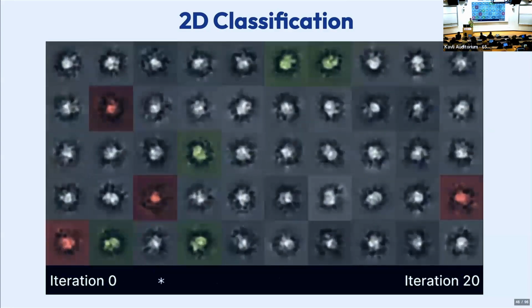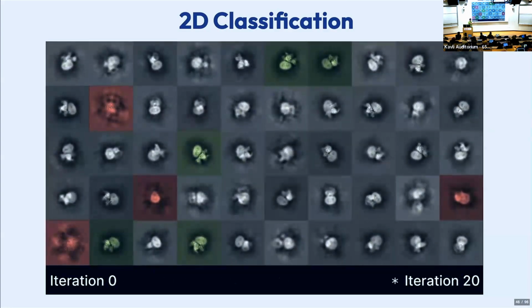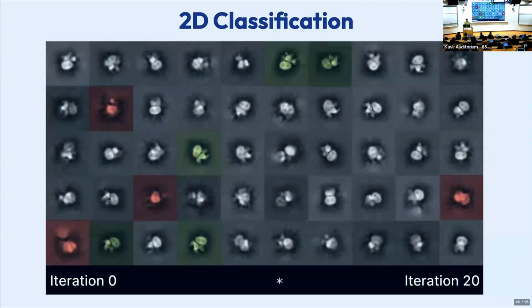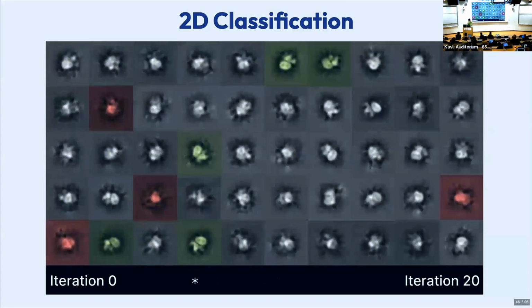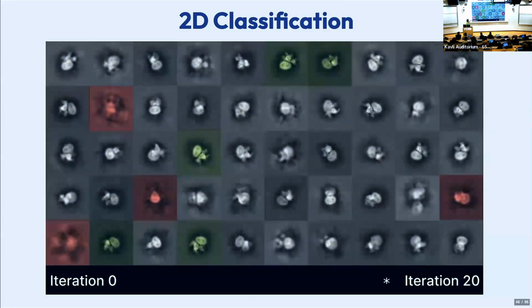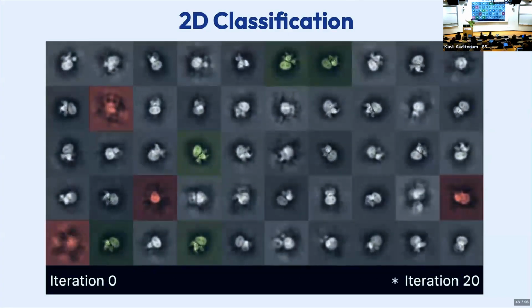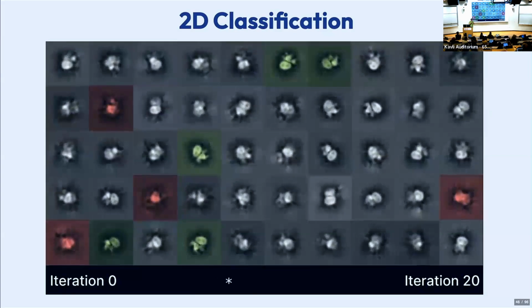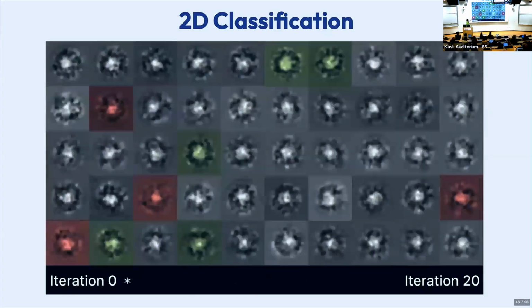What I mean is you're looking for good contrast between the light parts, the parts that are a particle, and the parts that are just background. You're looking for there to be no spikes that shoot off randomly. I don't see any here, but if it's a lot of noise that's been overfit, you'll have spikes that shoot off into the background that aren't a physical thing, and random speckly backgrounds.